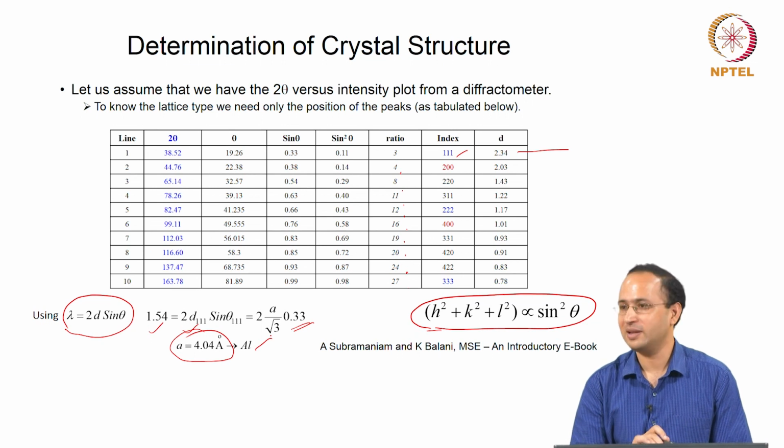So, this is a simple example, but it tells you that you can determine crystal structure. That is what Bragg did. Diffraction was known before Bragg, but he used the diffraction to determine the crystal structure.